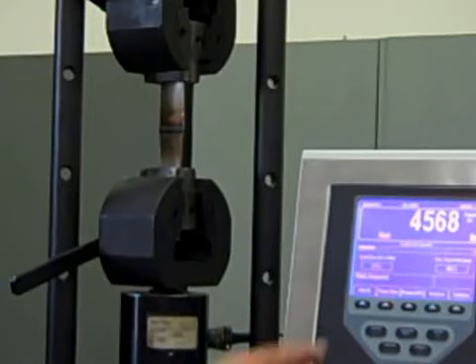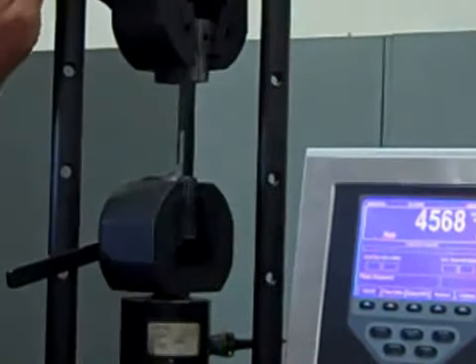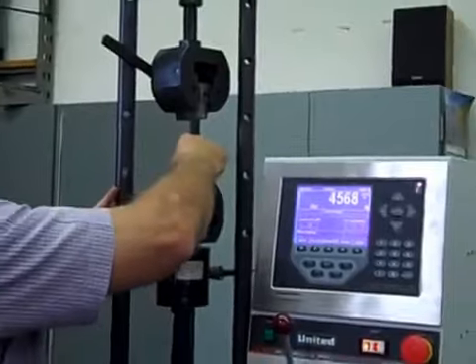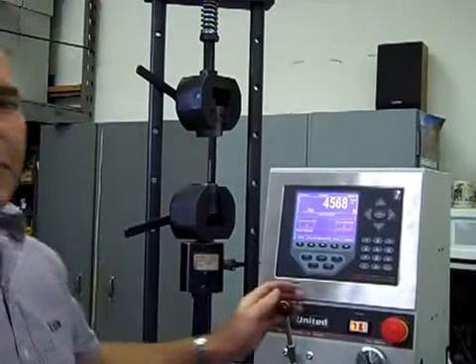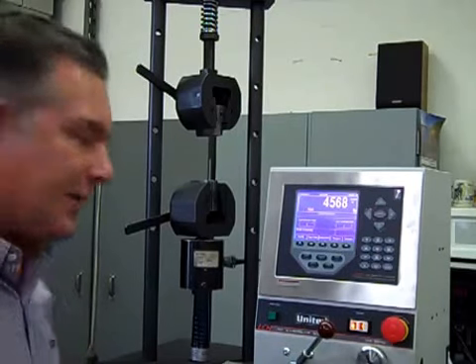The peak load is obtained, 4568 pounds. The specimen failed. The machine is put in neutral. The broken coupon is removed. The machine is returned back to home position.